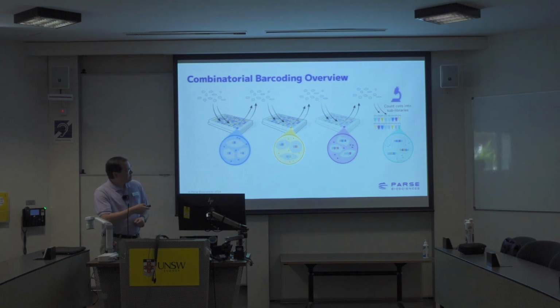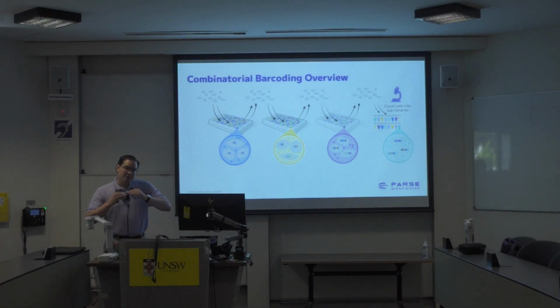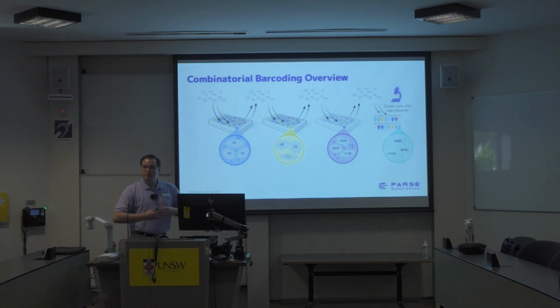And what's great about these sublibraries is you can sequence one of these sublibraries first, take a look at the quality, maybe oversequence it to look at your sequencing saturation, figure out how much you need to sequence before tossing in a lot of money to sequencing all of these sublibraries if you want to sequence them deeply. You get an idea of how your experiment's going to look before you jump all into the sequencing.